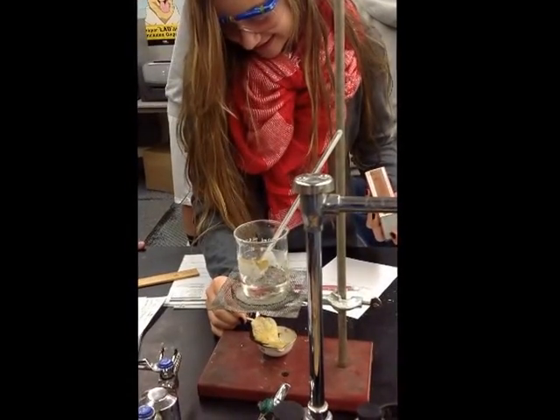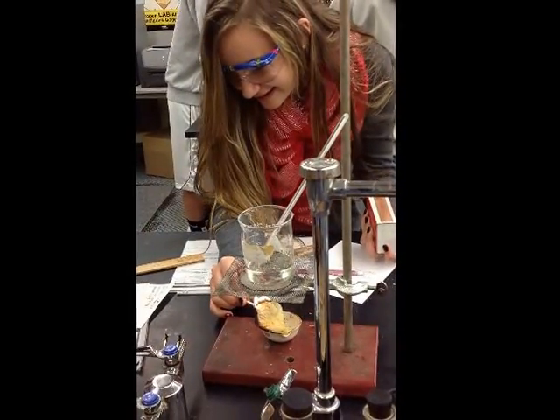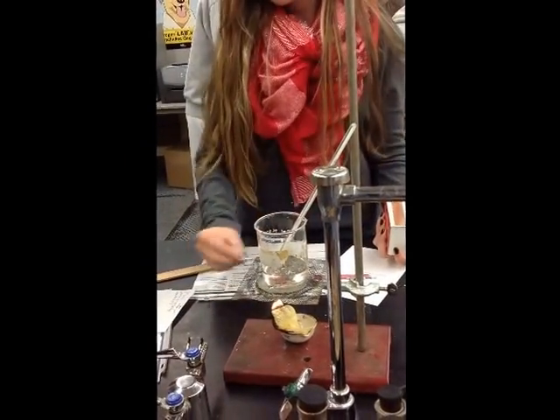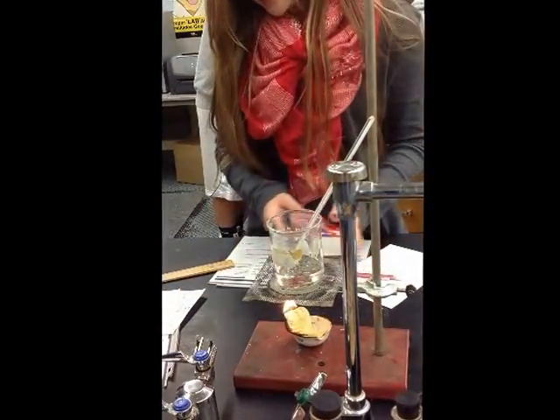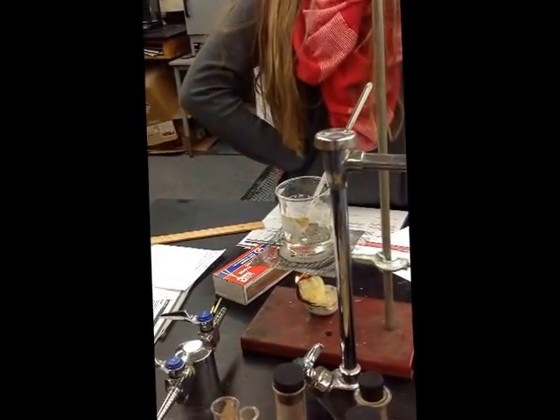These folks have their lab set up exactly as they're supposed to. They've measured the amount of water that they have. They've measured the initial temperature of their water. And they're burning that chip to find out how much energy it gives off. Nice work, Lab Station 2.